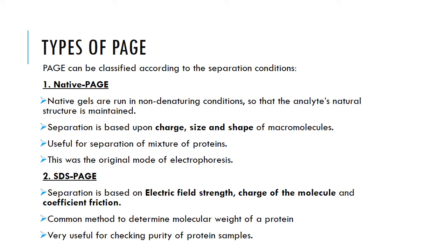For this one, they are run under non-denaturing conditions, so that the analyte's natural structure is maintained. The essence of not running the proteins under denaturing conditions is that we want to maintain the natural structure of those proteins.